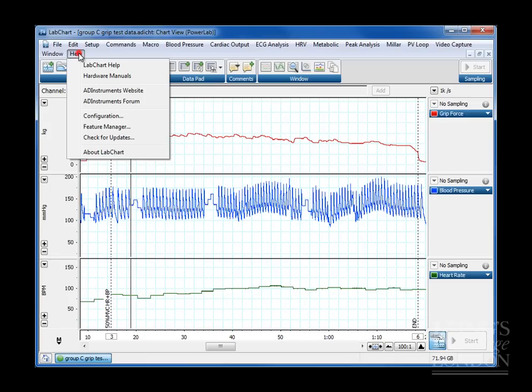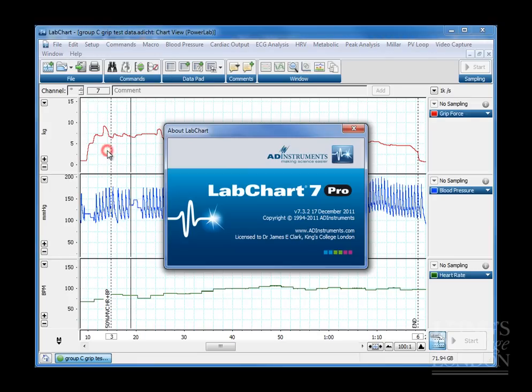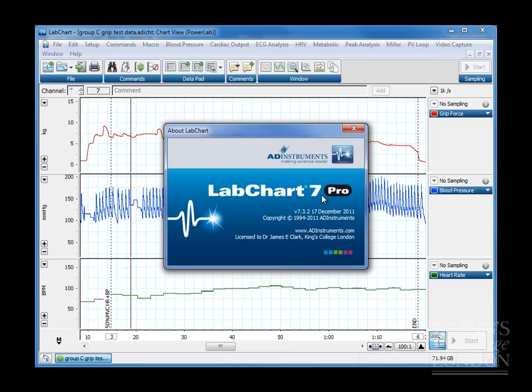Incidentally, I'm going to be using LabChart 7 Pro, which is the fully fledged commercial version of AD Instruments LabChart. You'll probably be using LabChart Reader, which is the free version. It's available on the PAWS machines and also can be downloaded free from the AD Instruments website. Just to let you know I'm using the Pro version just in case any windows pop up that you're not seeing on your machine.